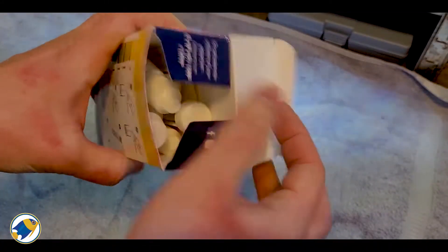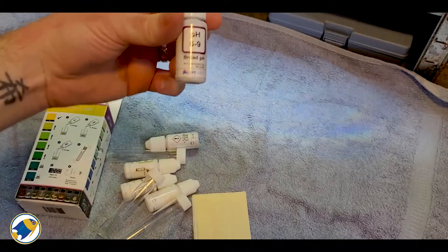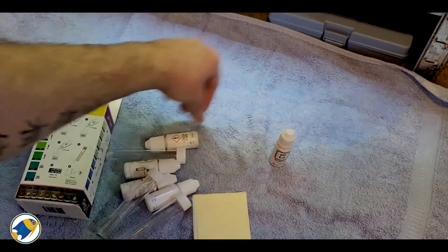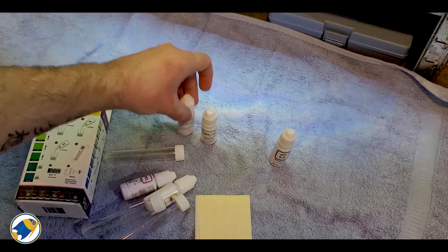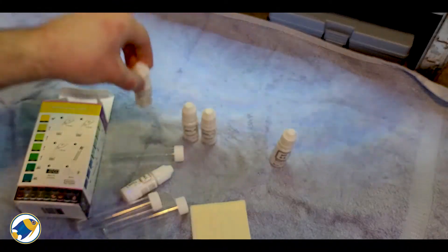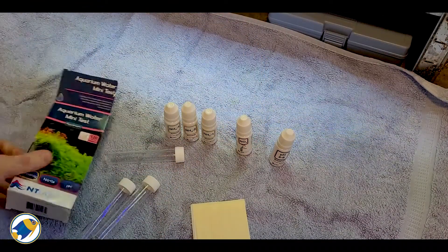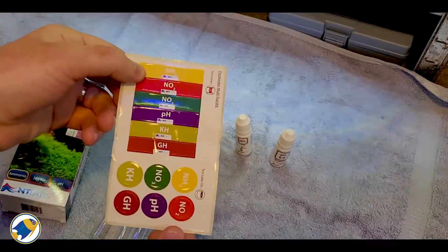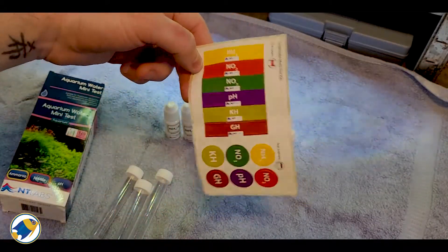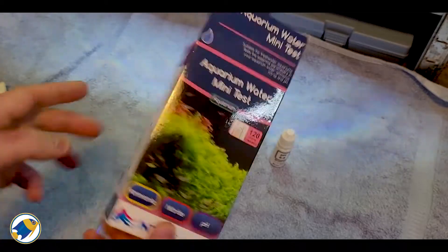Let's have a look at what we get inside. So inside the kit you get your pH solution, one, two, and three bottles of ammonia solution, and one bottle of nitrite solution. You also get three test tubes, which are pretty decent — they're quite solid, I've dropped these a few times and they haven't broken. You also get some cool stickers if you want to label up the test tubes so you don't get confused on what is what.